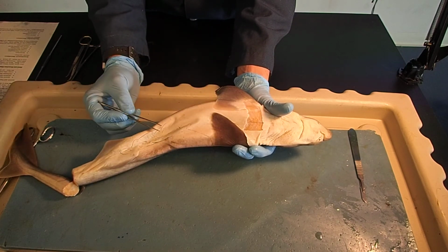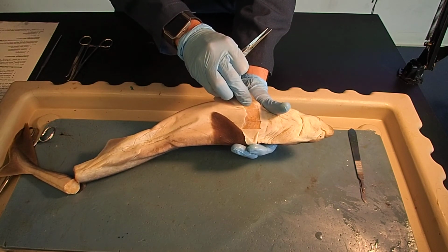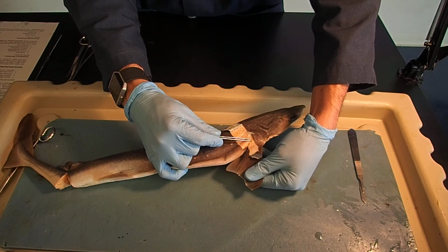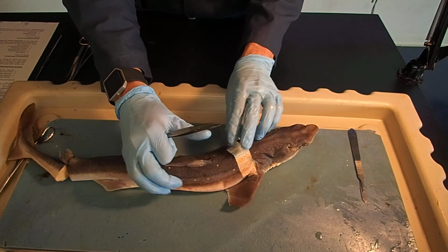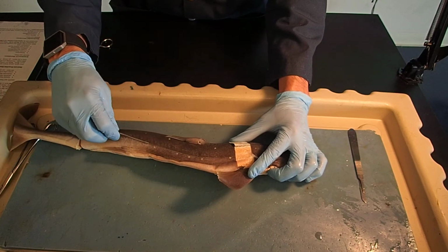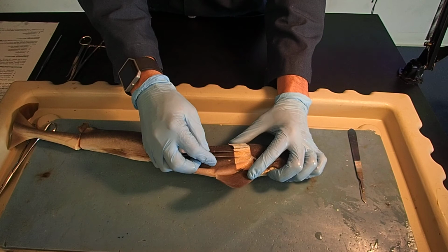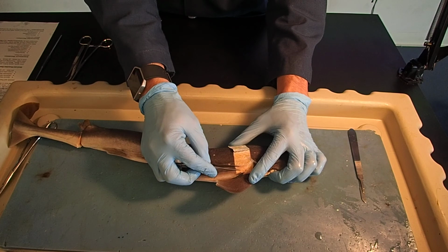They're symmetric. Here's my pectoral adductor, ADD. And here's my pectoral abductor, ABD. It's abducting it away from the body. The other one adds it back to the body. Here's my horizontal septum, following along with the lateral line system. Dorsal to that horizontal septum is going to be my epaxial muscles. Ventral to the horizontal septum is going to be my hypaxial muscles.